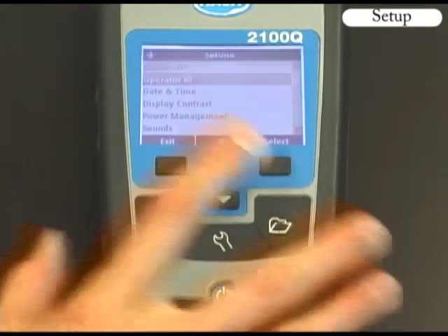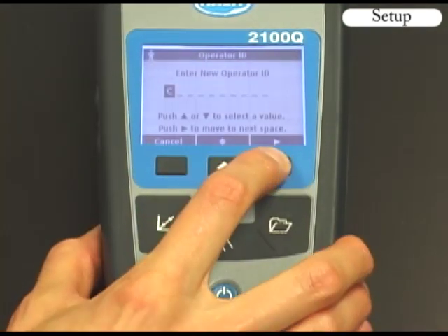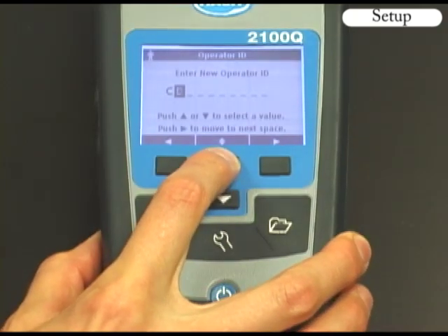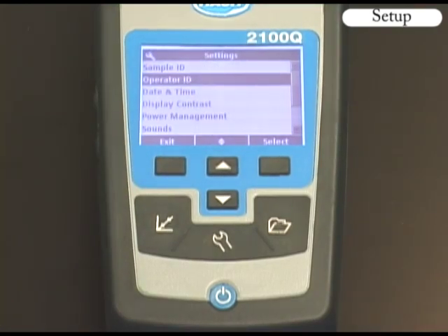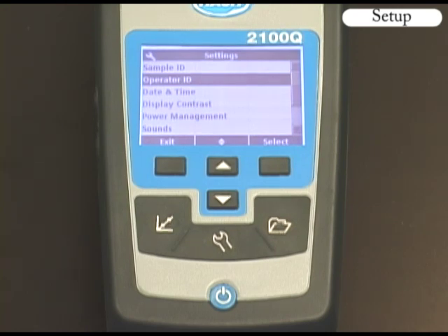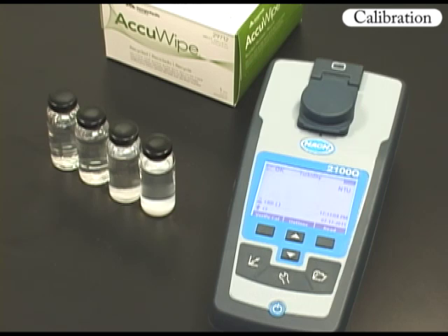Now I will use the same key functions to create an operator ID. There are many other possible meter settings, including display contrast, power management, sound, and security. Please refer to the full user manual on CD for specific instructions. We are now going to perform a full-range StableCal calibration, which is required when testing samples above 40 NTU. The EPA and HACH recommend calibrating your instrument quarterly, but your regulator may require more frequent calibration.